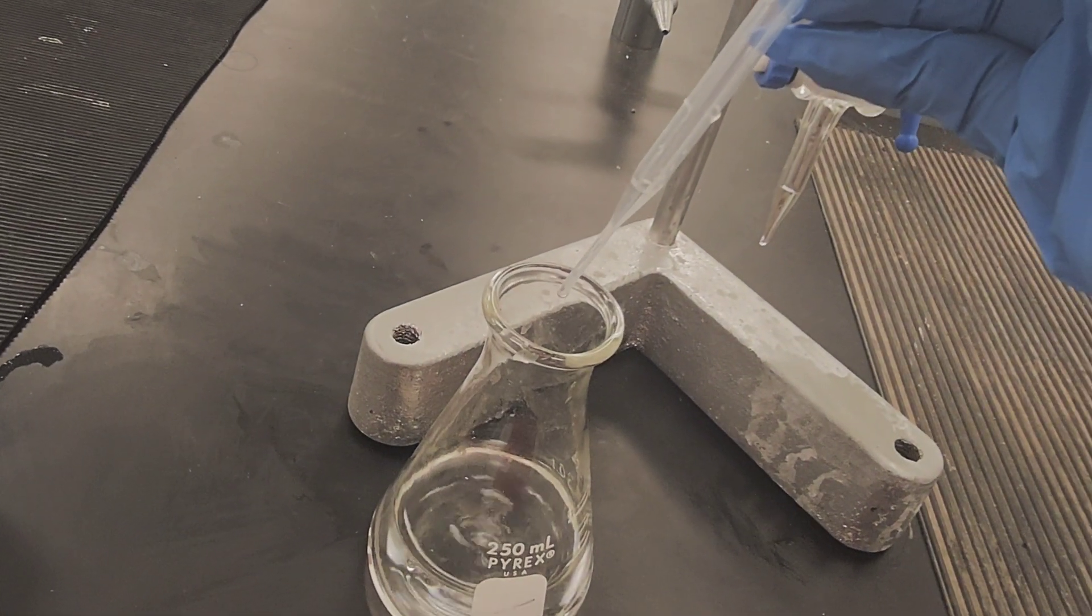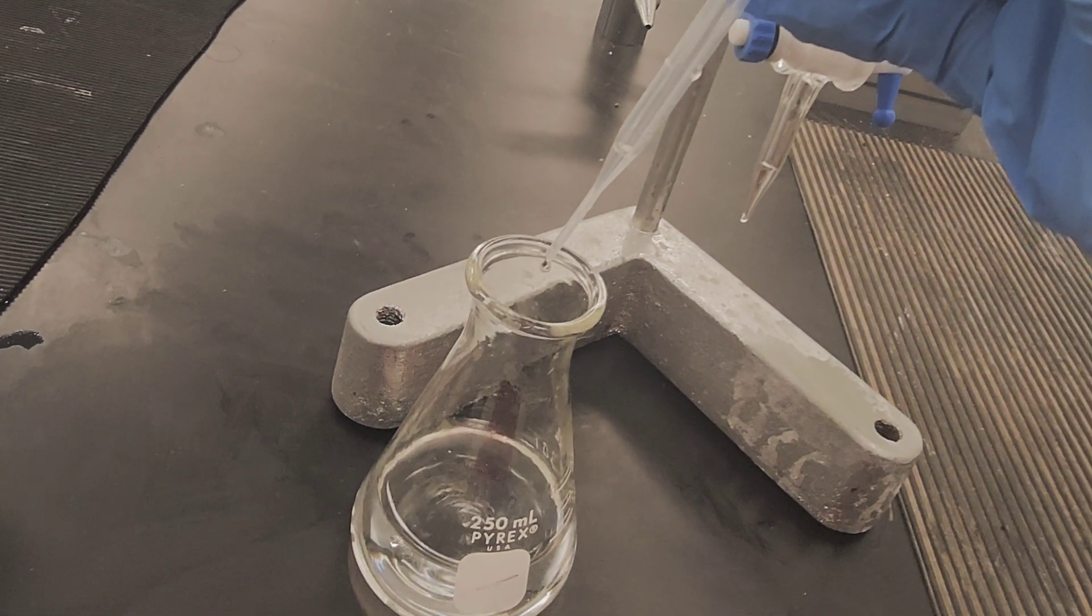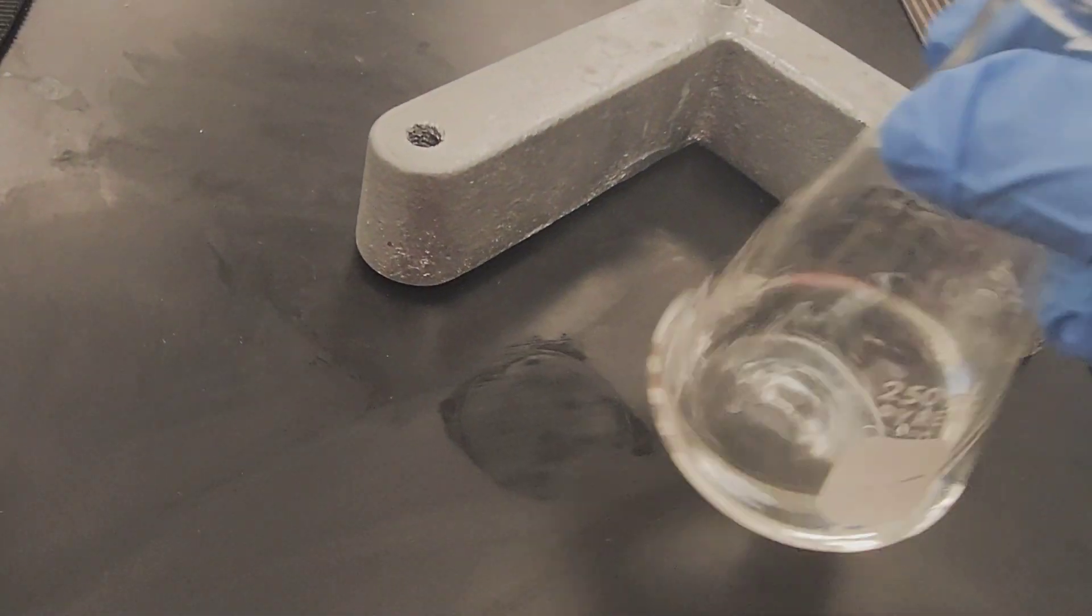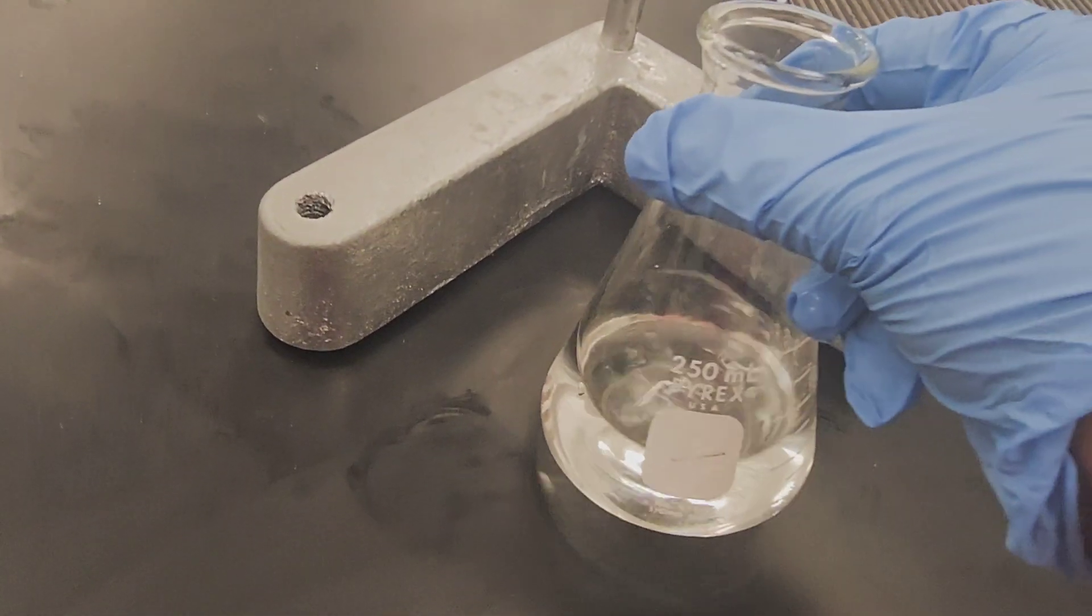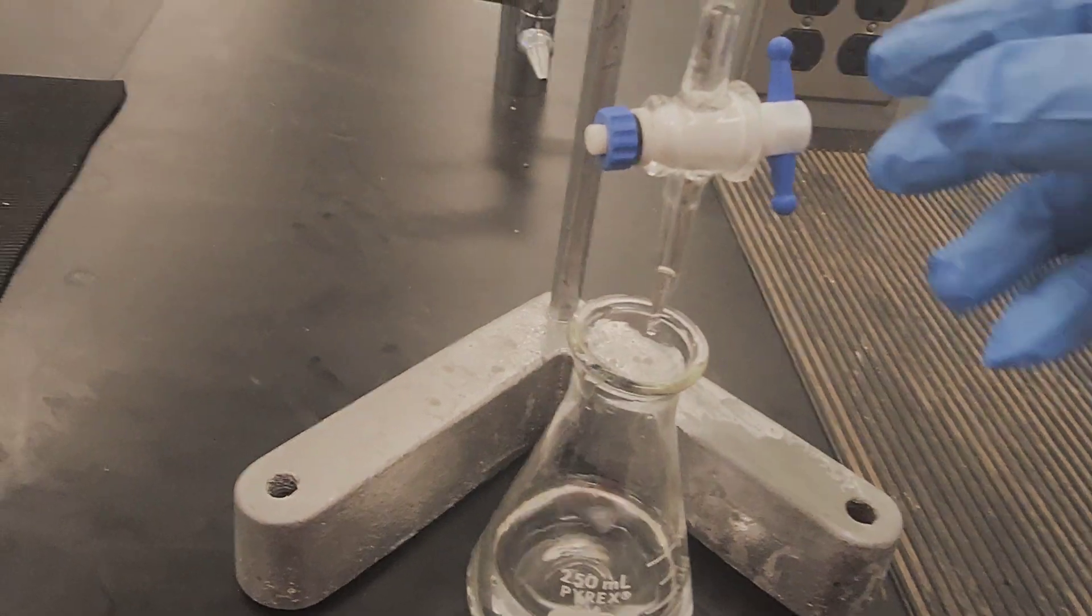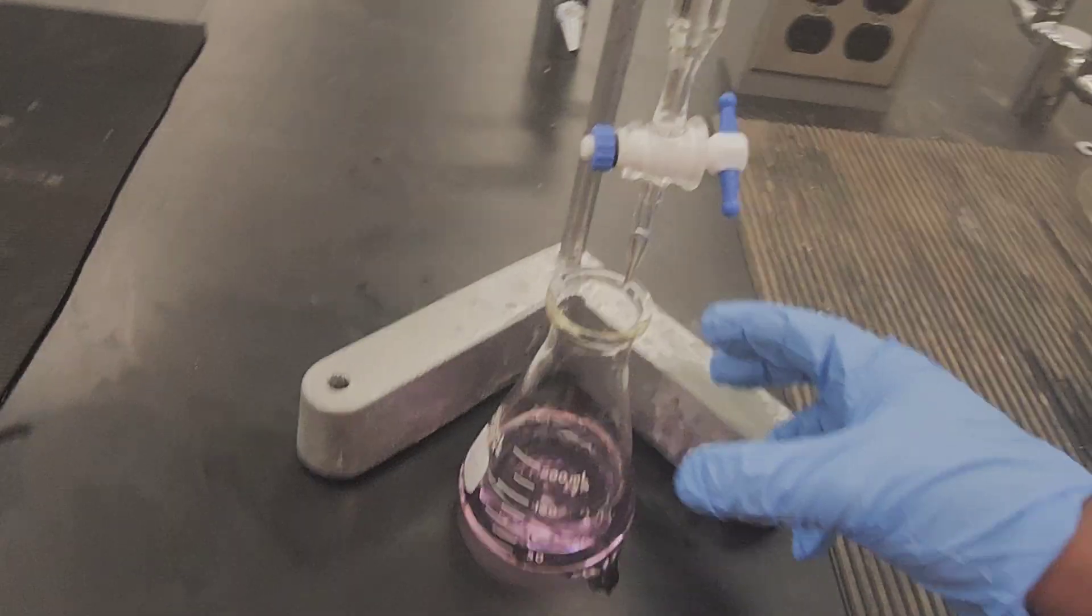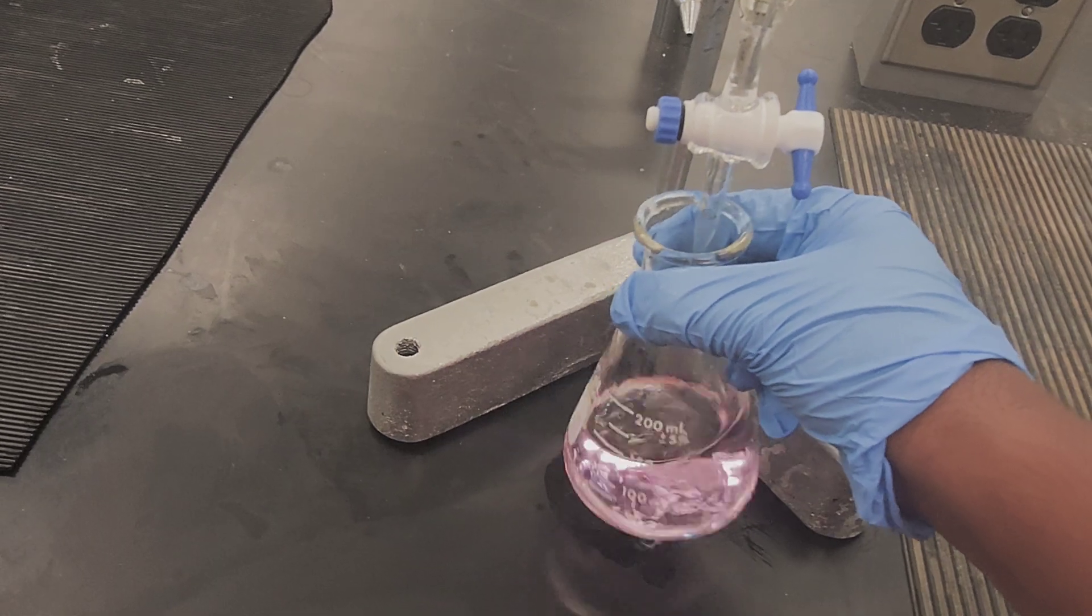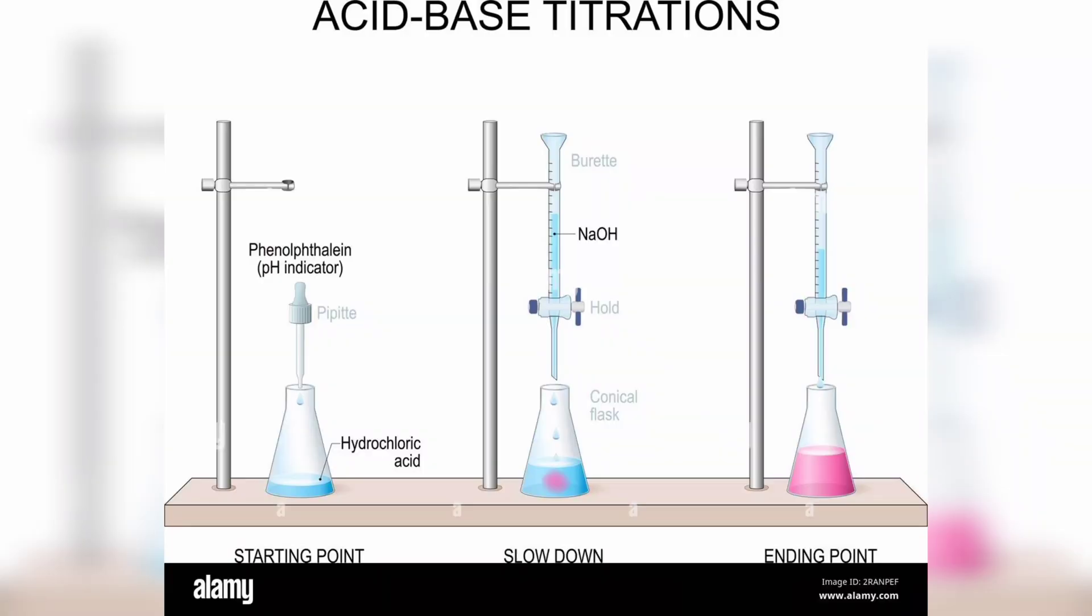Once we turn on the flow of 1 molar sodium hydroxide, the color starts changing to pink, and the color change indicates the endpoint of titration.